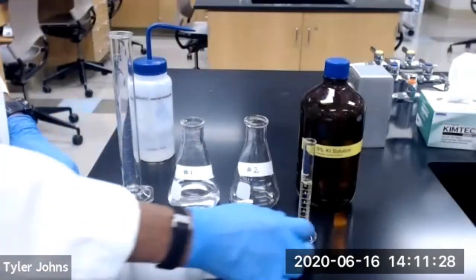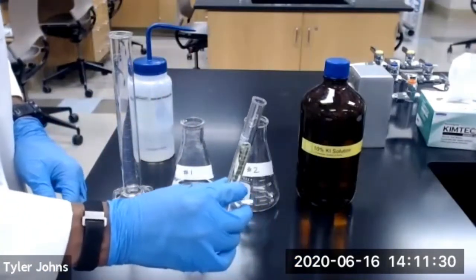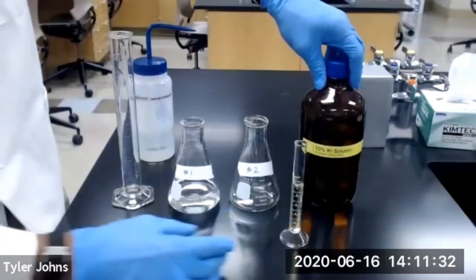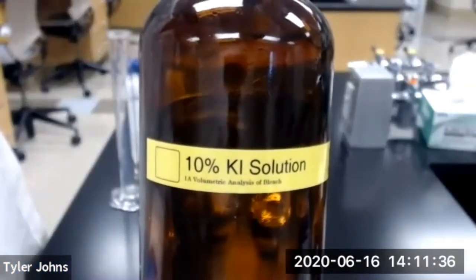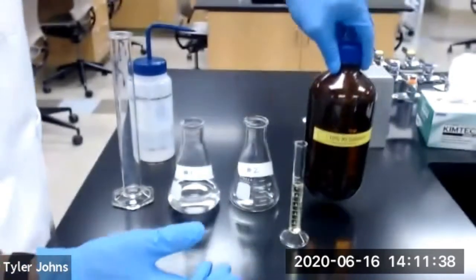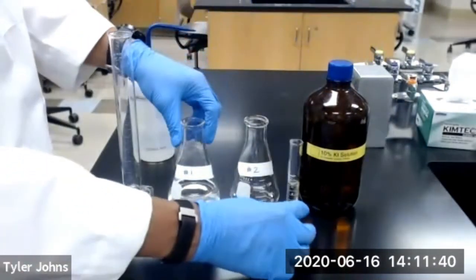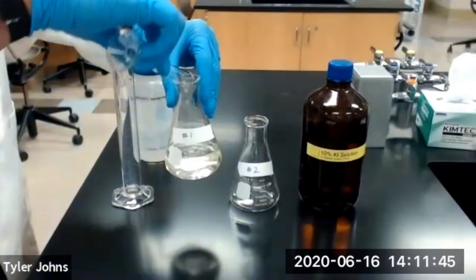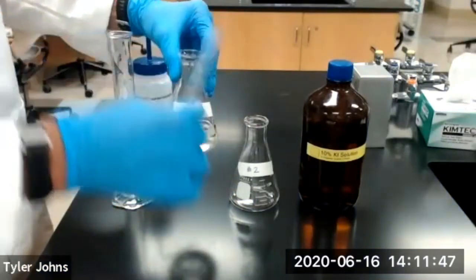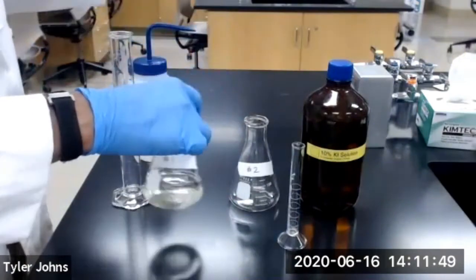And we're going to use a 10 milliliter graduated cylinder to add 10 milliliters of 10% potassium iodide solution also to Erlenmeyer flask number 1. And we'll swirl to mix.